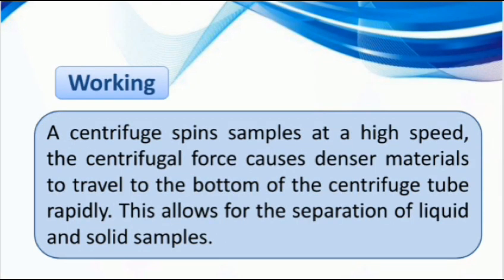If we go through the working of a centrifuge, it is the same as its principle. A centrifuge spins samples at a very high rate. The centrifugal force causes the denser materials to travel to the bottom and lighter materials to travel to the top. This allows for separation of liquid and solid samples.